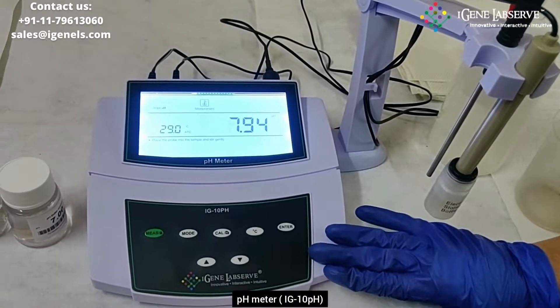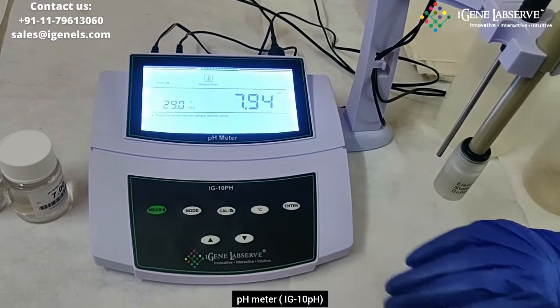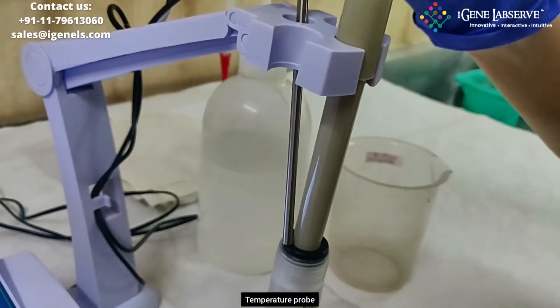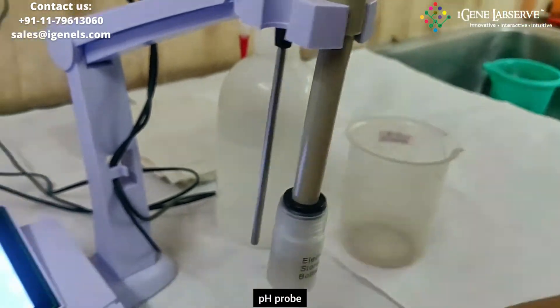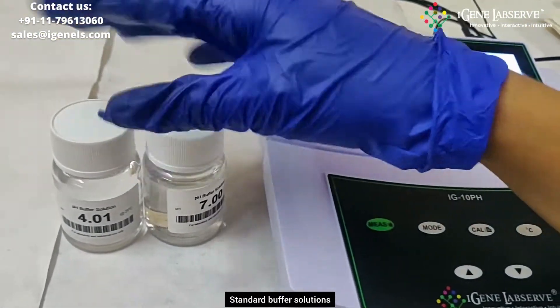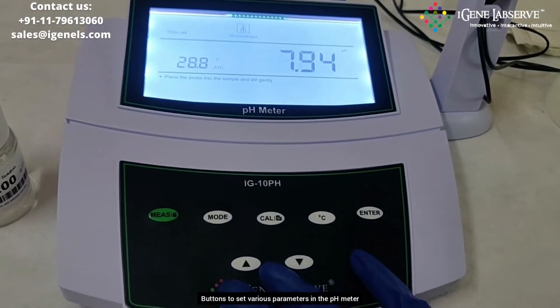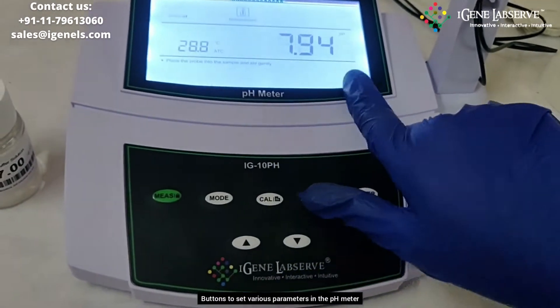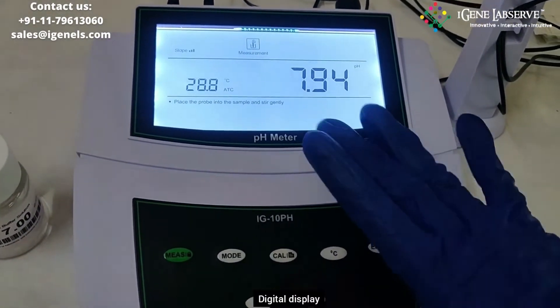This is IG's pH meter with model number IG-10 pH. It comes with a temperature probe as well as a pH electrode probe. It also comes with two different standard buffer solutions for the calibration of pH. These are the various buttons to control various parameters in the pH meter, and this is the digital display.